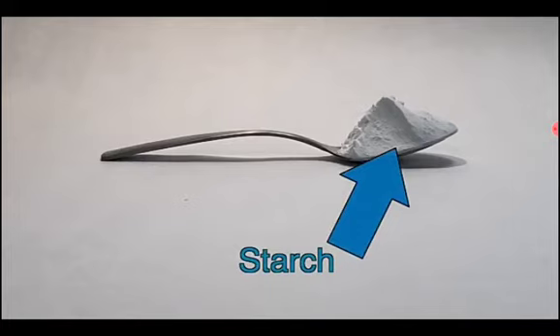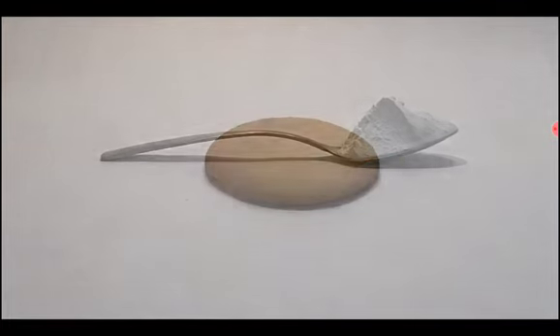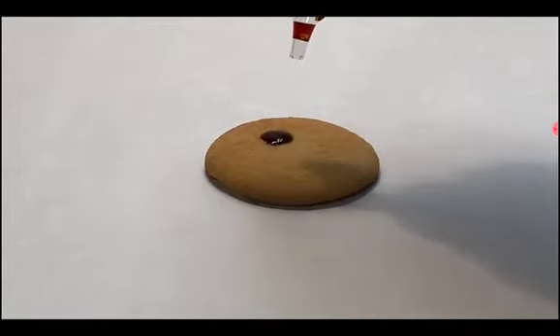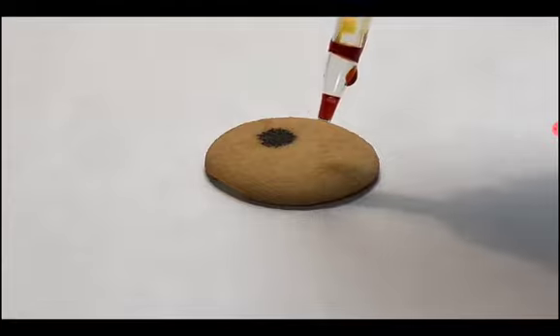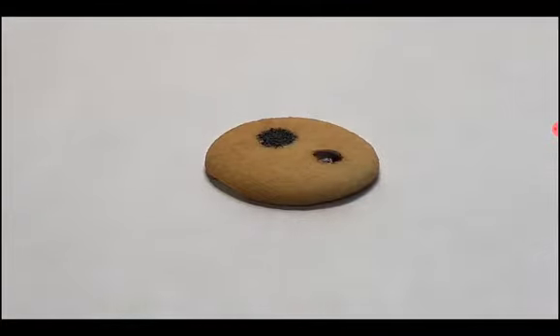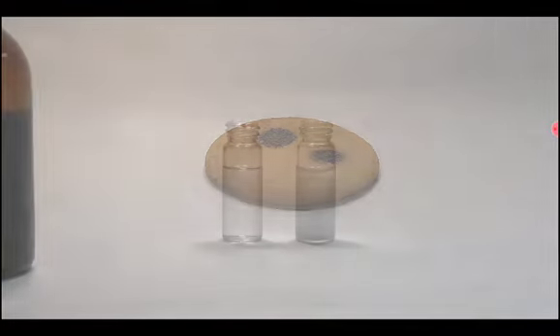Starch is a type of carbohydrate that is found in large quantities in foods that contain wheat, corn, potatoes, or rice. Many of the foods you will be analyzing in lab contain large quantities of starch, and an iodine solution can help identify whether or not you successfully removed all the starch from your isolated sample.